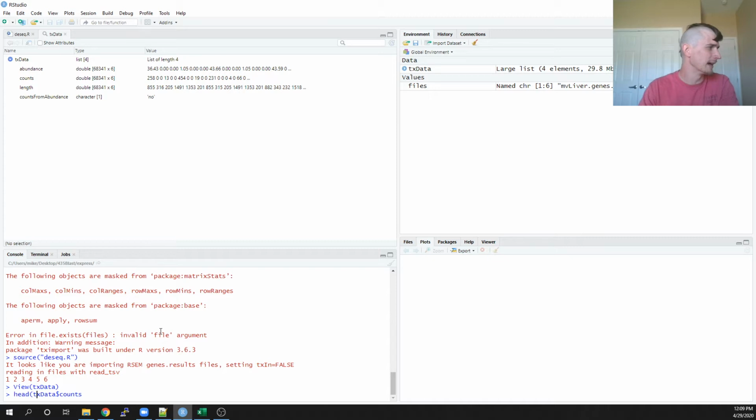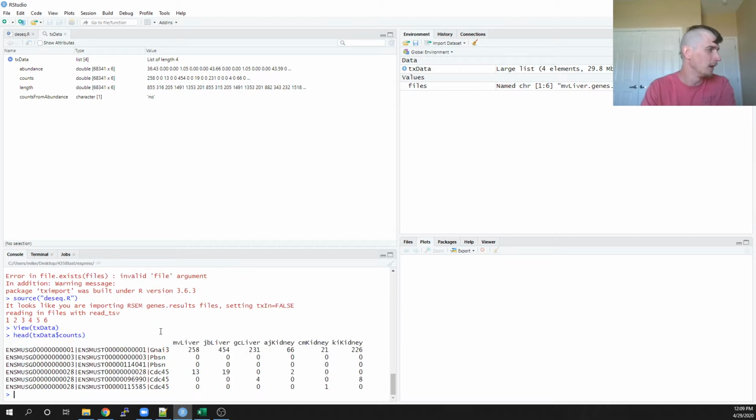So it is kind of nice. I don't know if I mentioned this, but R does have the same command head. It works kind of the same, gives the same information. But right, so it's keeping count of our count data, and it just makes a new matrix. This count matrix is just a new matrix that has all of the gene names and all of those expression values, all those read counts found in all of our files, found from that list of files.